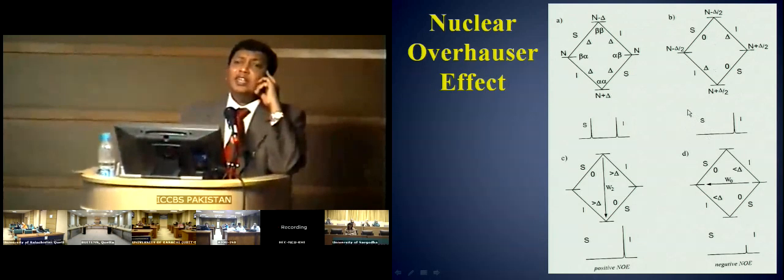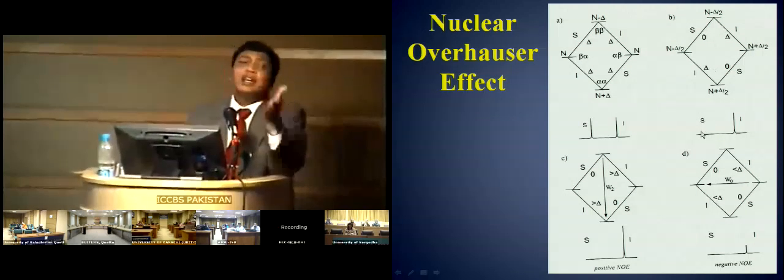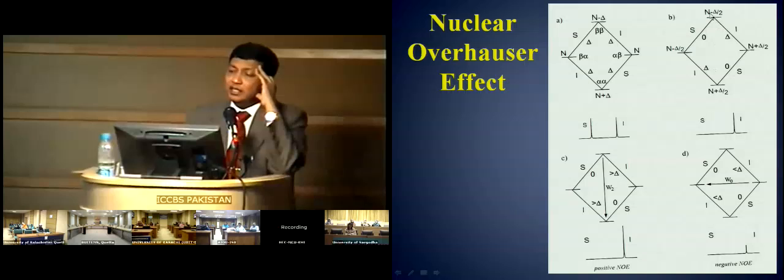When you irradiate S, you don't see any peak of S because S has died actually, gone. It has transferred its population to a different energy level. The I would of course be available, and this is a single quantum relaxation.